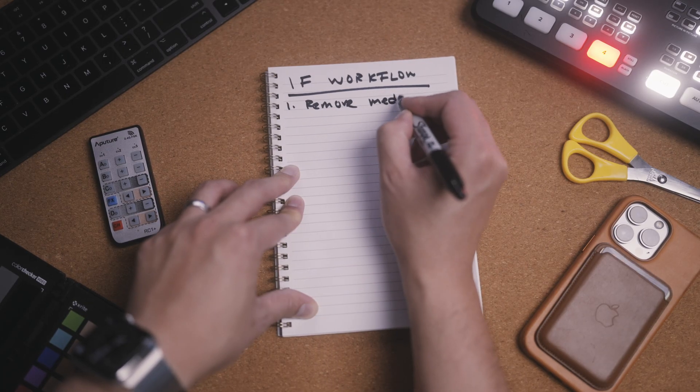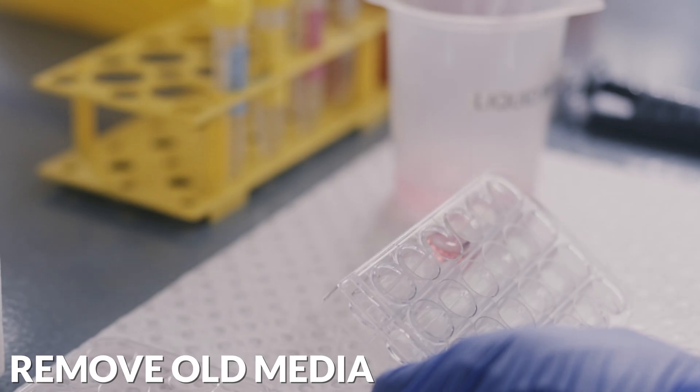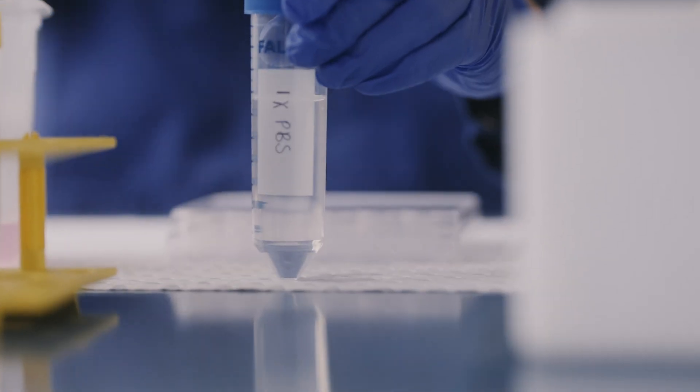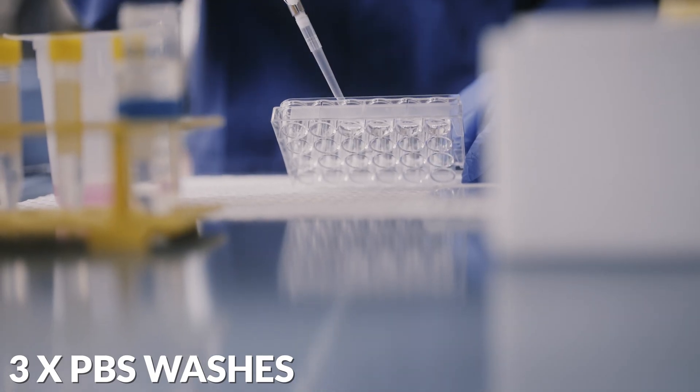We first remove the media from the wells and do three washes with PBS. Remember to be gentle when drawing up or pipetting liquid — try and do so at an angle down the side of the well rather than directly onto the coverslip.